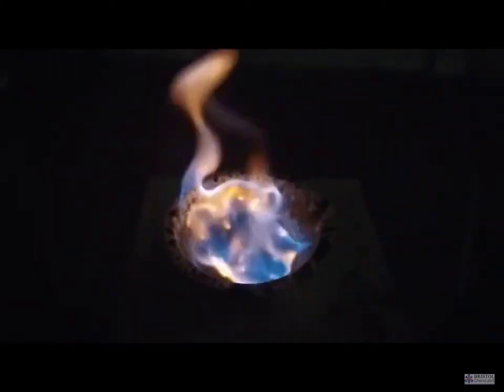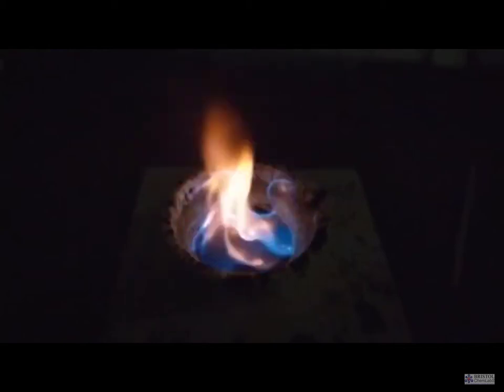Even though there was no audience present, we needed a safety screen to protect the camera lens against spitting bits of chemical, and the demonstrator wore a full face visor as well as lab coat and gloves.